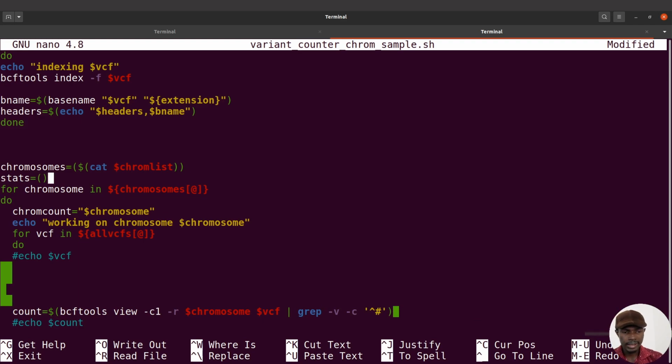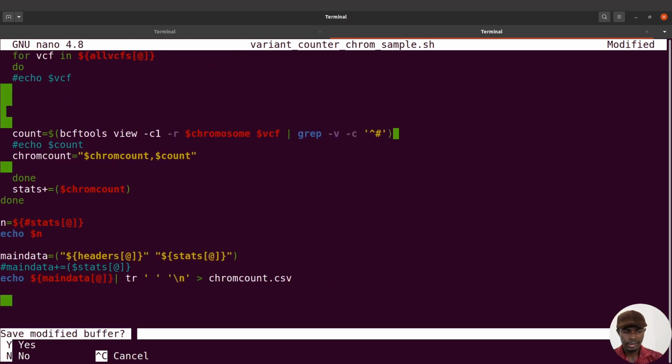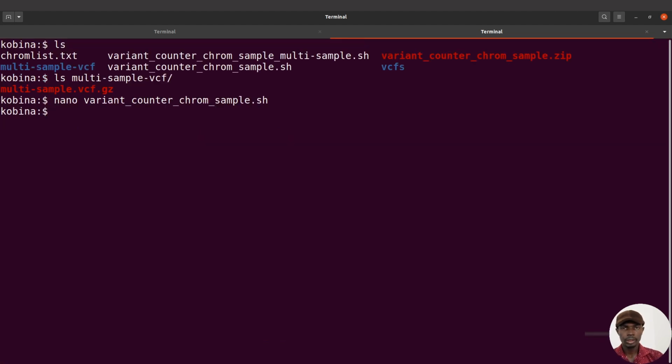So let's edit and save changes. Again, I will add execution permission by saying chmod +x and specifying the file name. All right, that's done. Now I am going to execute the command. I'll call it like this, but you can also say bash followed by the file name. That's also fine, but I will use the other approach. Let's execute this command.